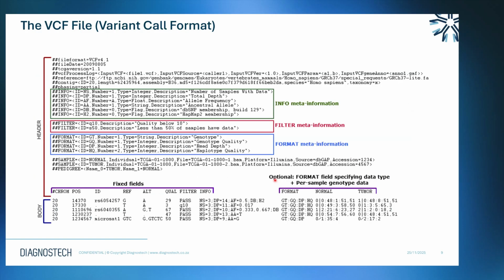And then finally, the variant calling file, the VCF. This is really generally the end of a variant calling workflow. A variant file will be generated. And what it contains, obviously a really big header. The header is just really metadata, information on the filtering and stuff like that.